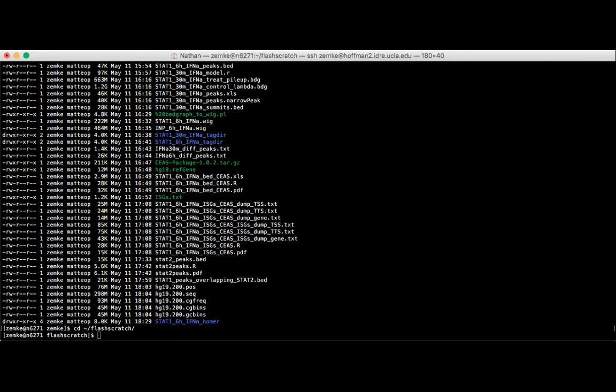Alright, well, for what we're doing, the reason you want to request an interactive session is because you could have your job killed for using resources that you didn't request. But we're not going to be using a lot of resources today.